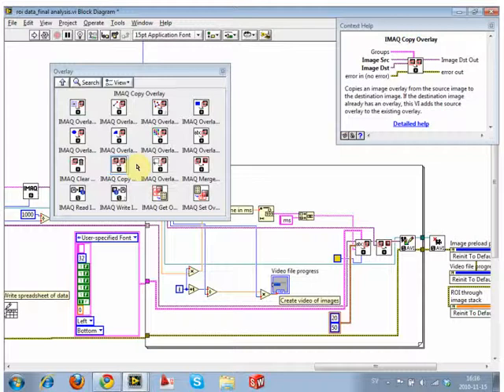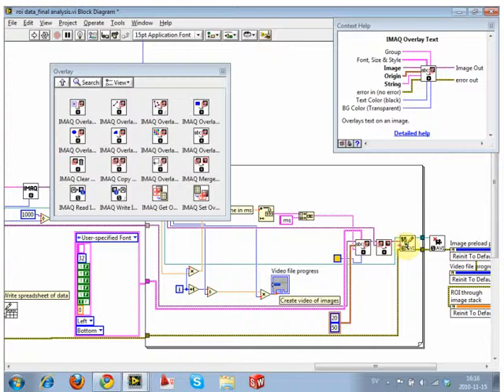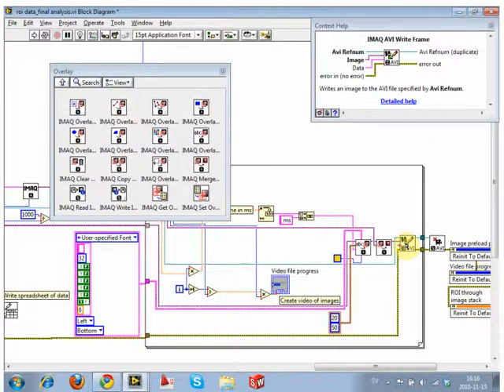And if we didn't do this function, where we're essentially merging them, for now just take it, if we didn't do this, and we actually just did our overlays, and then read out and saved them as an AVI, it would not have any of the overlay information, because these overlays are just bits of data which are not on the image. It's just a line that's hanging out in your data file. It's not part of the image. It's not until we flatten this image, just like in Photoshop where you click on the layers and you say flatten it, does it actually become part of the image.